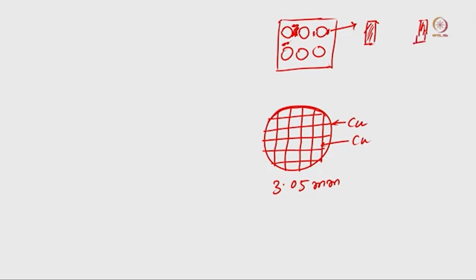Now in the cryo-electron microscope, generally we use a pipette and a small amount of sample, 3 microliters, and add it onto this grid, and then the sample will be distributed over the entire grid uniformly.